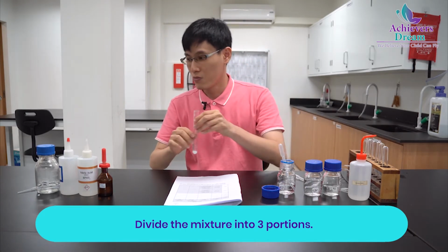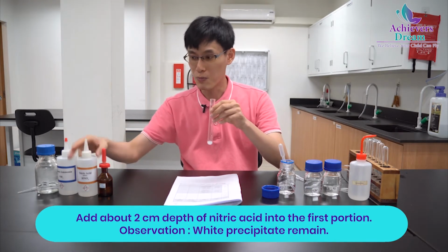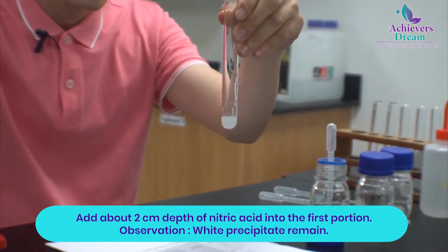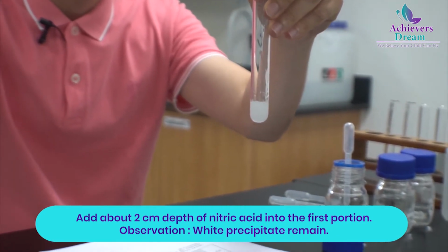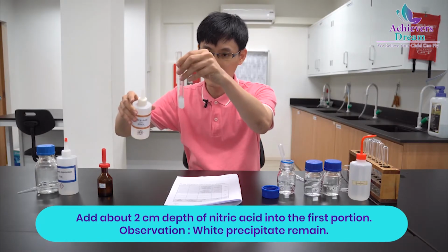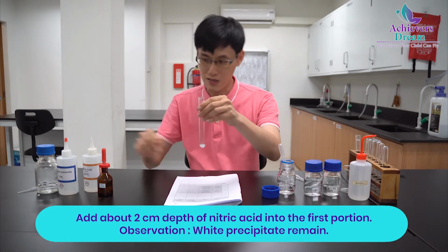And after that, we will be adding nitric acid, dilute ammonia and concentrated ammonia to our 3 portions. So let's start with nitric acid. Let's see if the precipitate dissolves. Okay, so the acid is going in and you can see that the precipitate is still there. Nothing's happening. It's still there. This is expected because silver chloride does not dissolve in nitric acid.